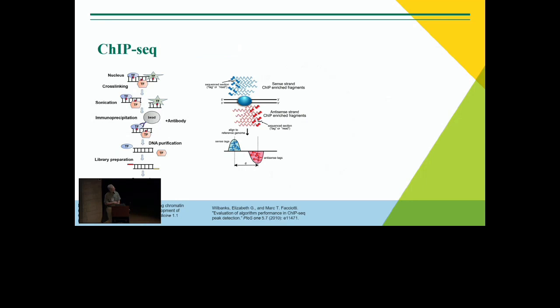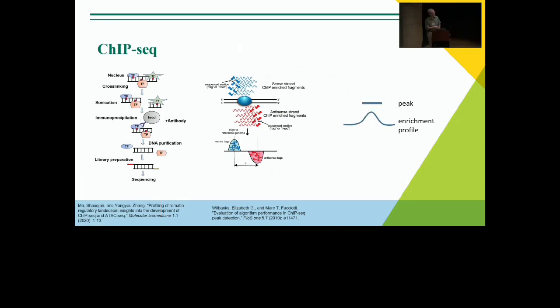So I don't think ChIP-seq needs much introduction. The main point here is that at the end of this process, you end up with enrichment profiles, which are fragment pileups, and then you call peaks on this. And these peaks are your areas of interest in the ChIP-seq experiment.